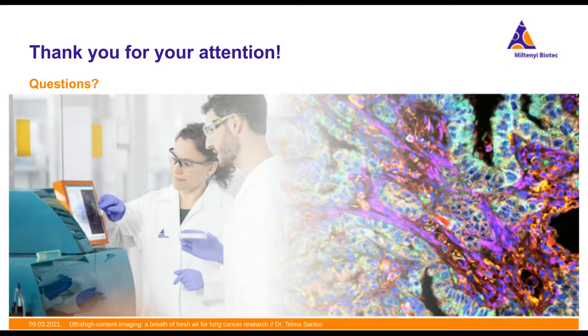Thank you, Dr. Santos. Next question. Do you use markers or nuclei shape to define necrotic areas? So in this one, particularly, what I did was just checking at the nuclei because it was quite strong. So all these very pointy and very strong signals. I didn't check specifically for markers.